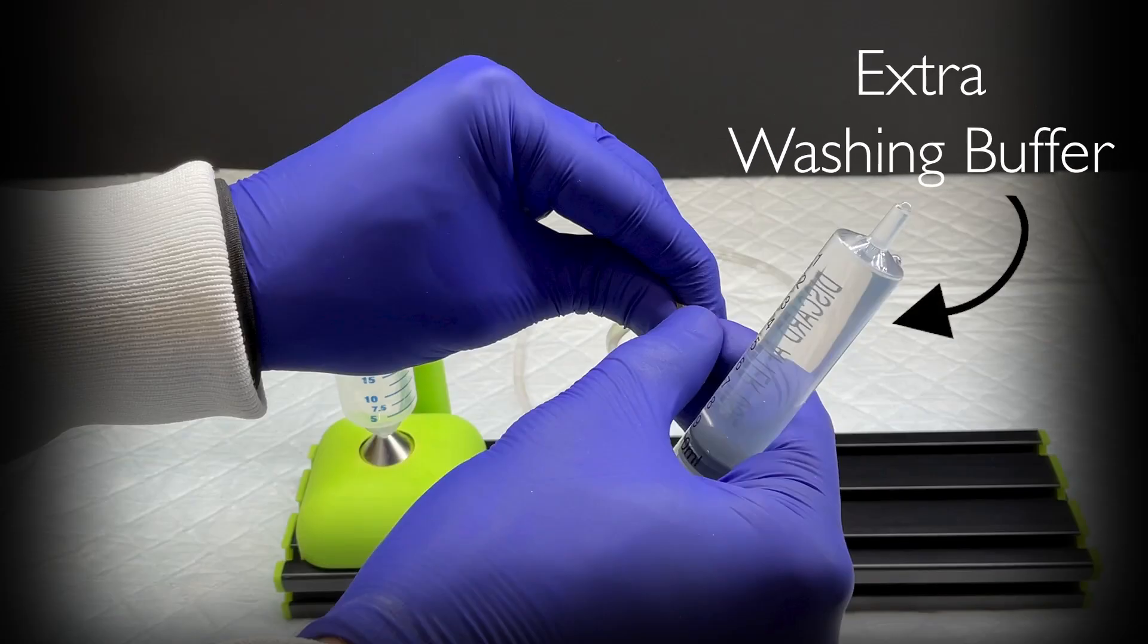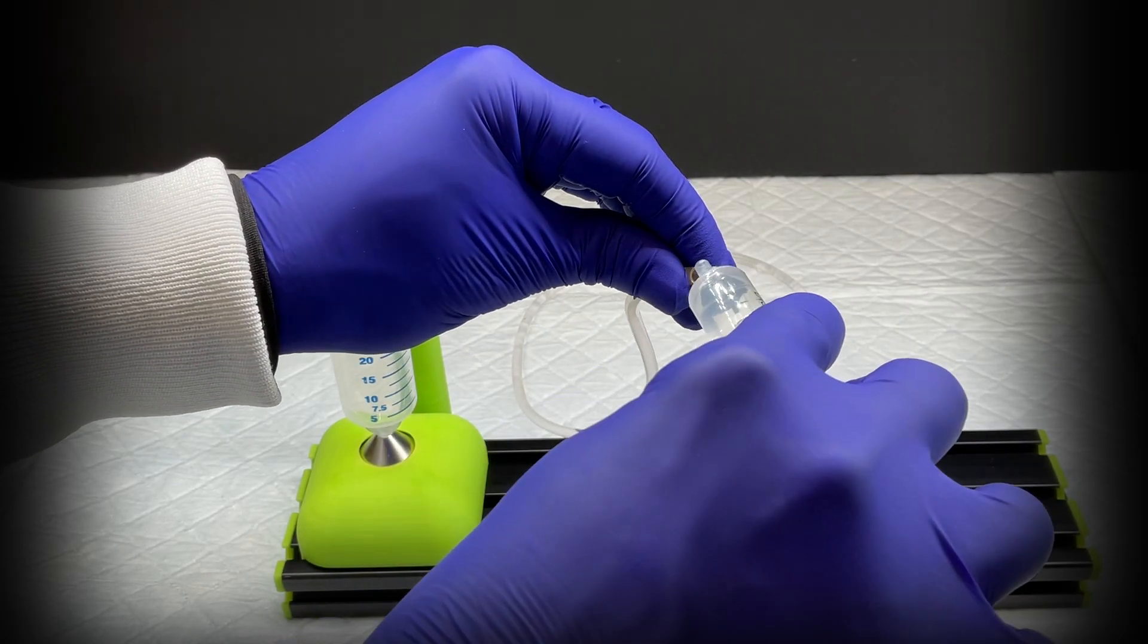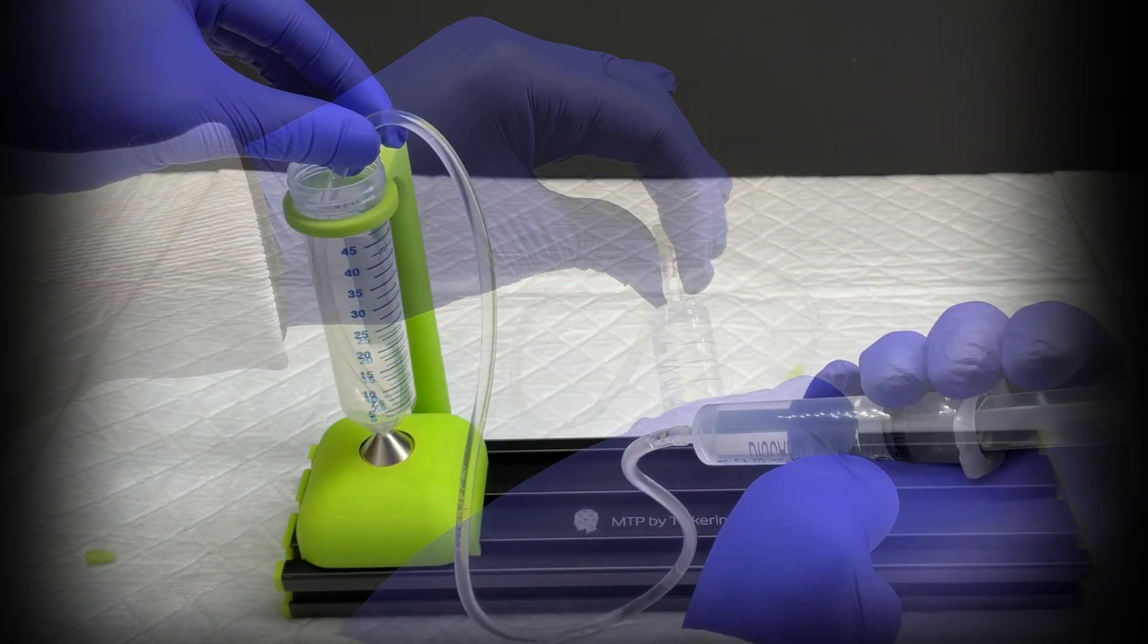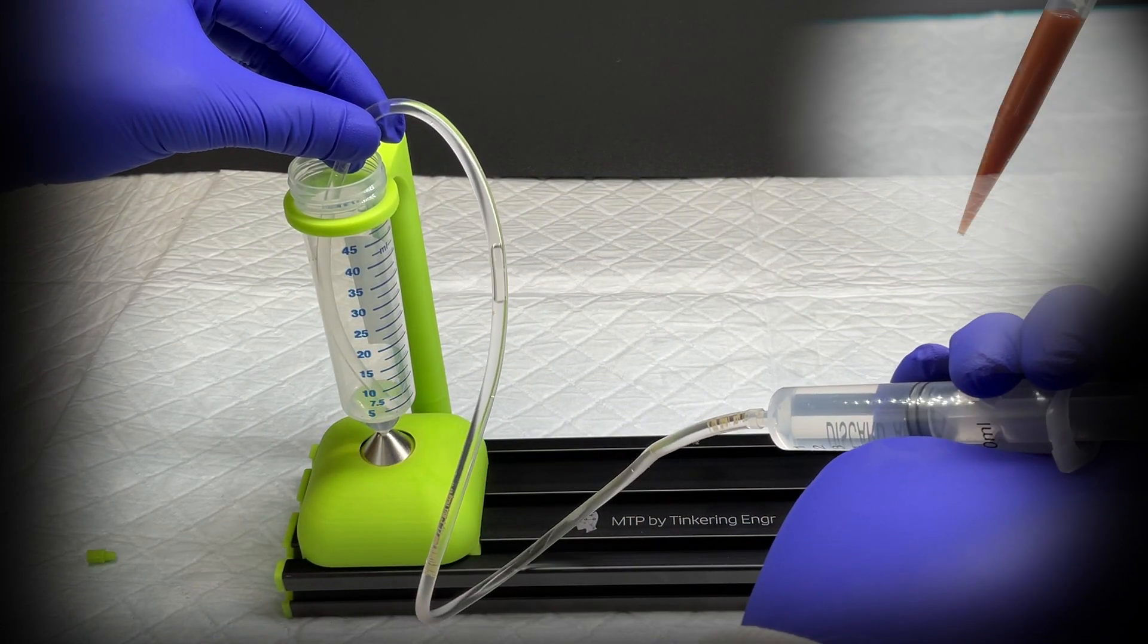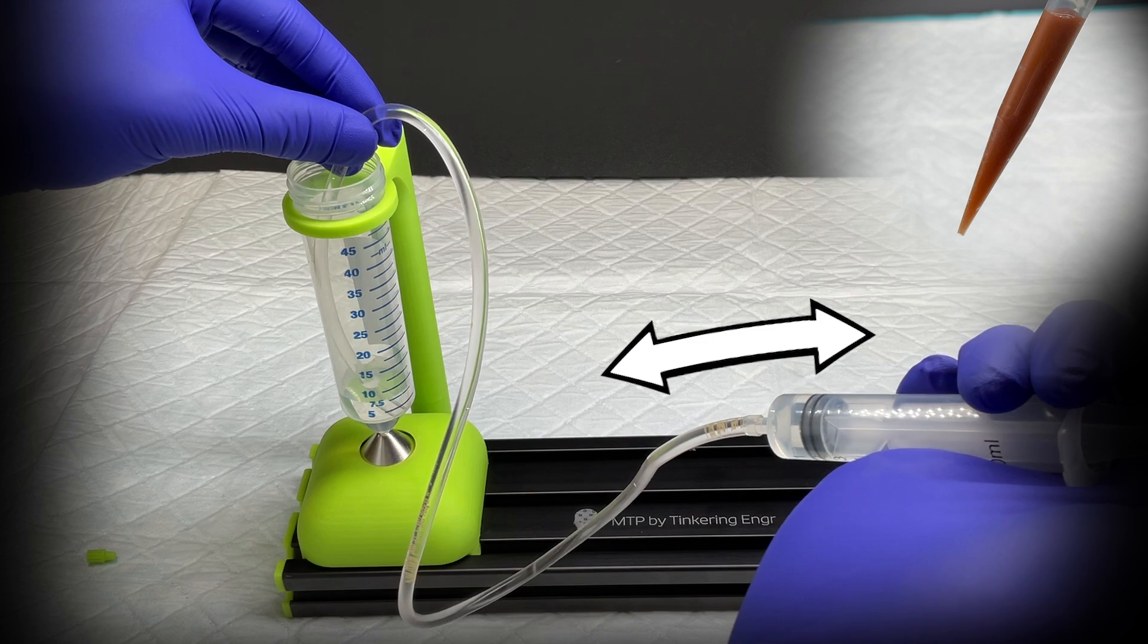I take about 10 milliliters of extra washing buffer to purge the tubing into a conical tube resting above the cone magnet. If a large amount of resin is used, you may need to cycle the purge once or twice to remove all the resin in the tubing.